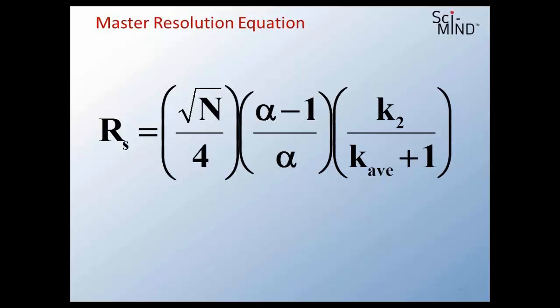You've got the number of theoretical plates, our column efficiency. Okay, we've got alpha, the selectivity there in the middle, so there's your chemistry. So you've got column efficiency, you've got the efficiency of the engineering of your instrument. You've got chemistry there with alpha in the middle, so our column chemistry. And then finally, k, the retention factor, is just how long you're in there, because you need to be in the column long enough that you can make a separation happen, but not so long that you're wasting your time. And really all three of these factors come together to help us get resolution.